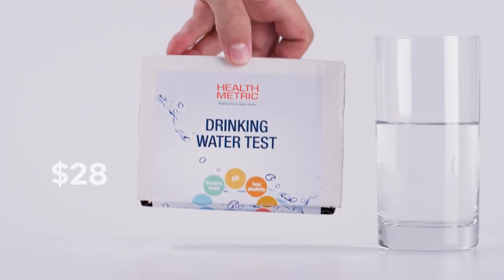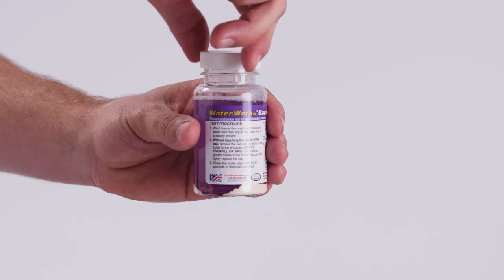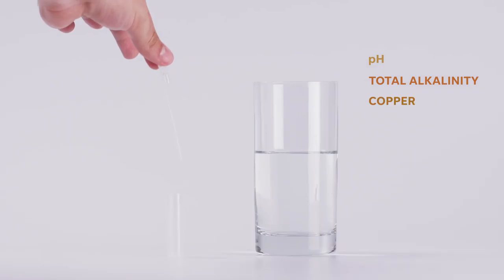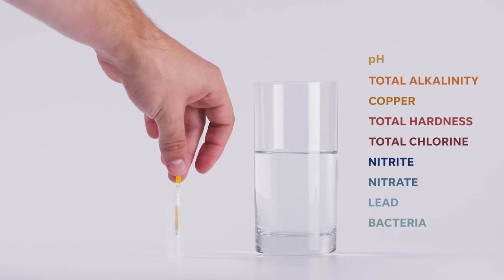If there is something that stands out and has you concerned, you can get an advanced testing kit. While these tests are more expensive and only single-use, they are more accurate and can give you a better reading of specific problems with your water. This specific kit tests for pH, total alkalinity, copper, total hardness, total chlorine, nitrite, nitrate, lead, and bacteria.